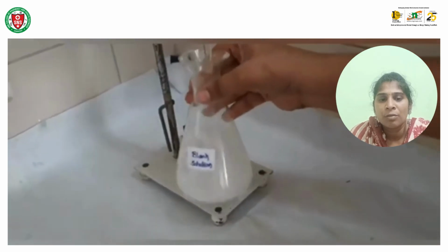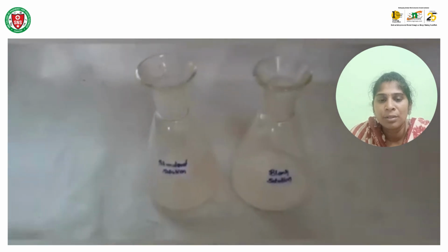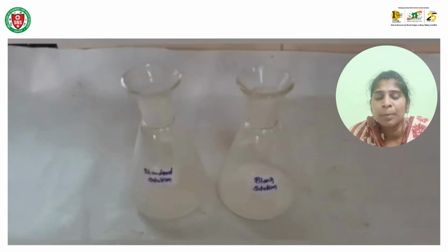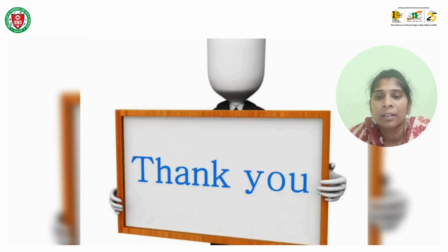The titration process is over, and after taking the burette readings of the standard solution and blank solution, we calculate the saponification value with the formula. B is the sulfuric acid for the blank. We took about 15 ml of sulfuric acid, and we got a value of about 178. So it falls into the range.